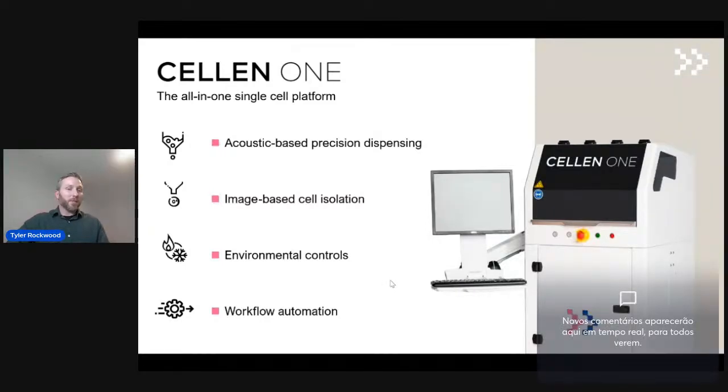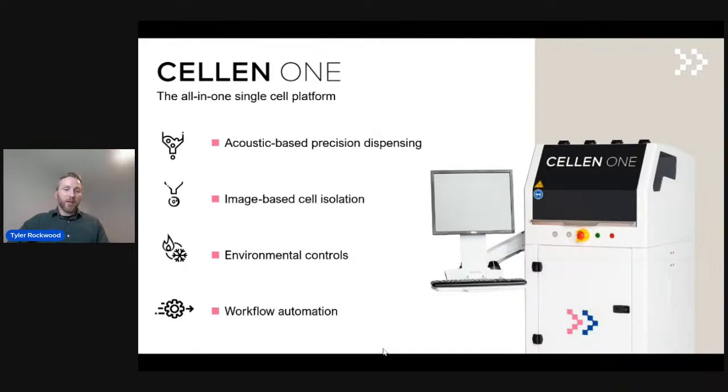Finally, we have environmental controls on the deck, which allows us to do incubations and longer processes without having to remove the samples from the instrument. And those three together allow us to automate this workflow so that there's fewer manual handling steps.